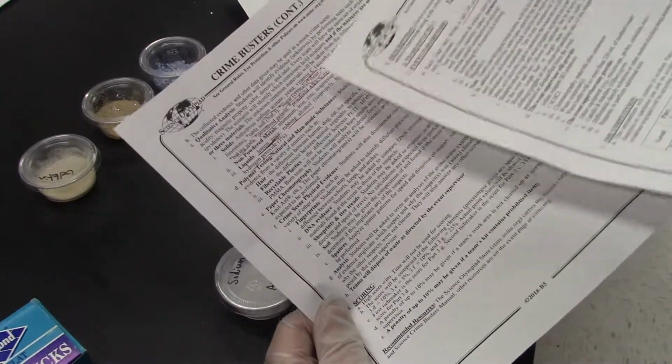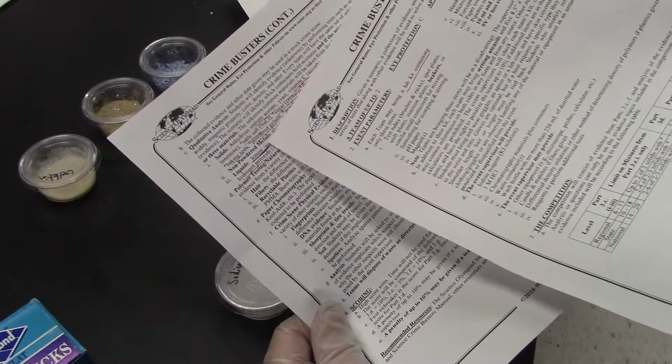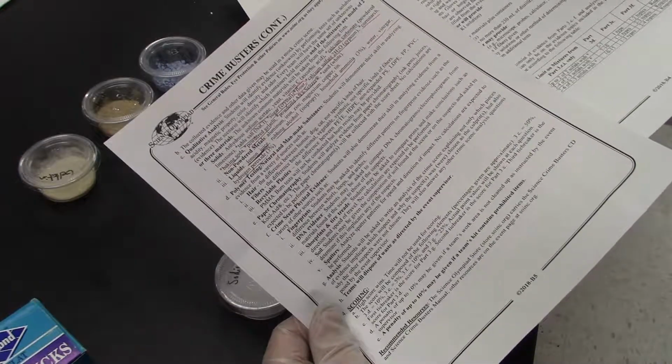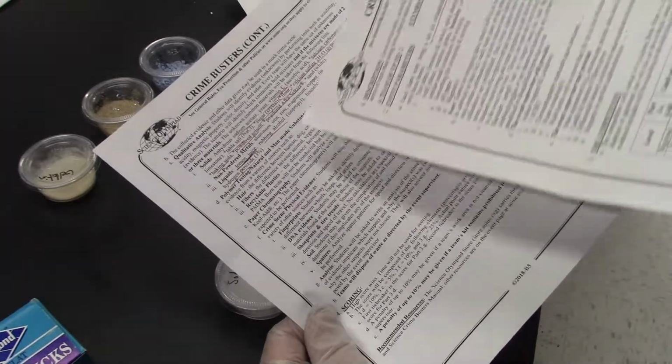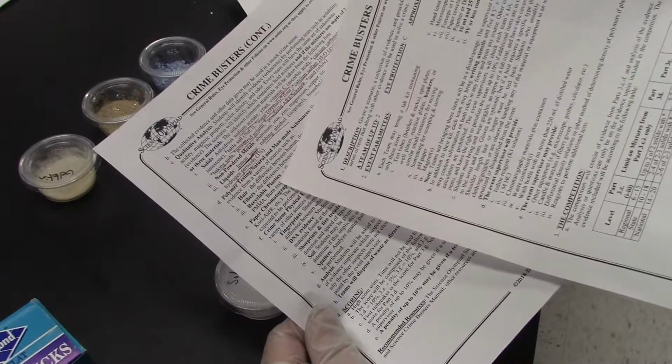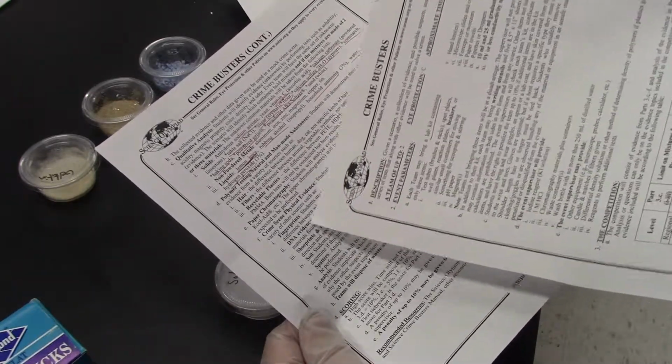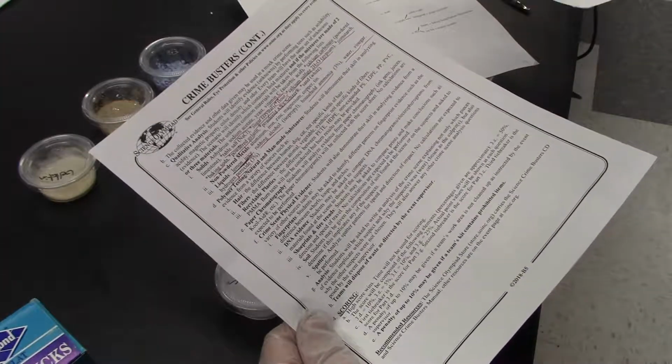Now, moving forward, we'll want to look at some metals, and we'll want to look at some of the liquids that are listed as well. That'll be another video, and then eventually we'll work our way into hair, fibers, some of the plastics, paper chromatography, and then looking at fingerprints, DNA, shoe prints, soil, and some blood spatters.